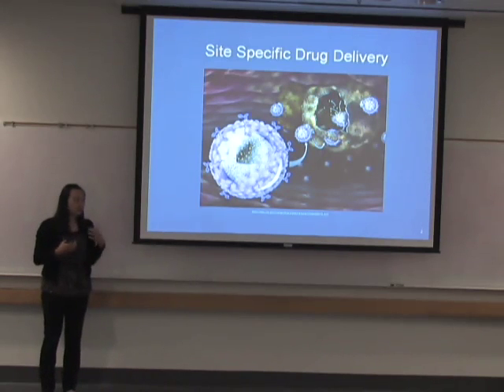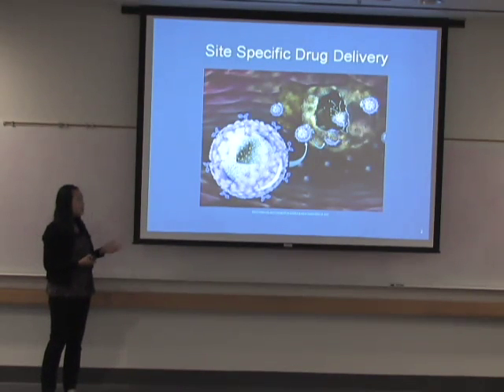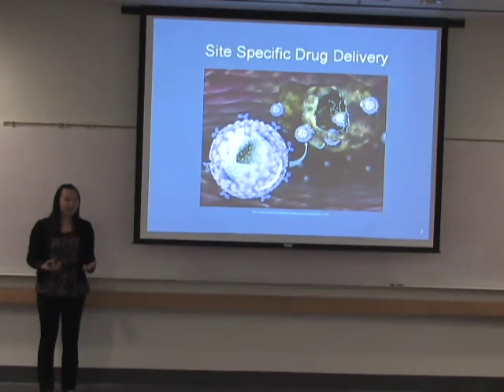These particles are extremely small, so they have to be viewed with a microscope, which gives us a limited field of vision. They're also moving in fluid. If we want to, for example, add a drop of liquid to change the pH of the environment to see what happens to our particle, it will move our particle out of our field of vision. If we can't see what's happening to the particle, we can't determine whether or not our method is actually working.